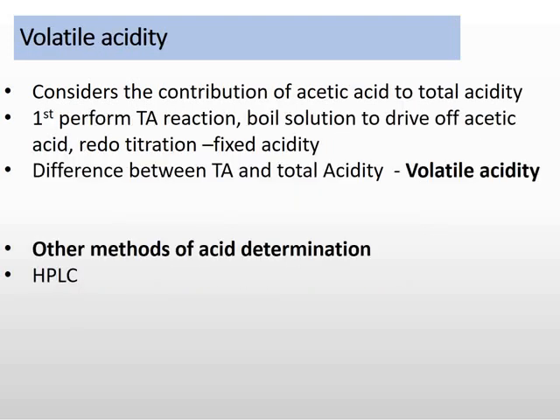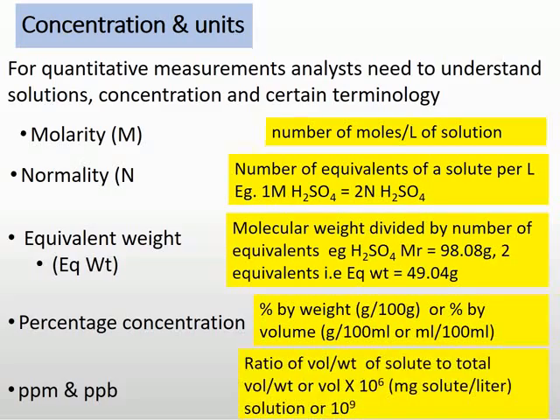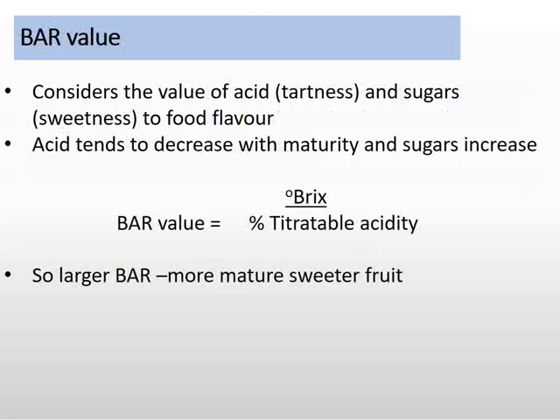But then we have to go to the actual way of calculating your ratio value. What happened to that slide? Okay, so I'm just missing the titratable acidity calculations. That you can find in your practical manual. So you will determine the Brix, and then you will divide it by the percentage titratable acidity. I'll emphasize more of this in the actual practical. I thought I had it here.